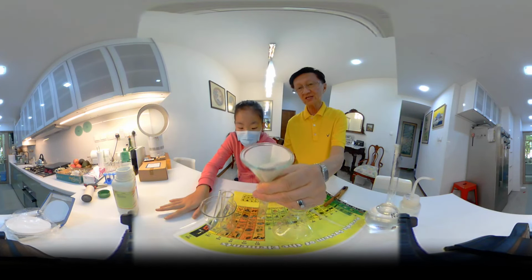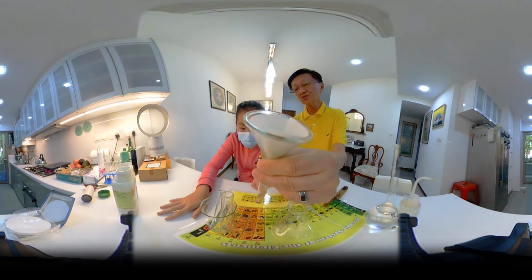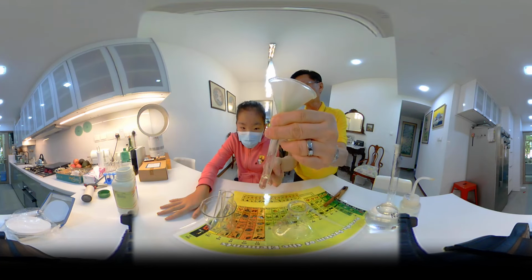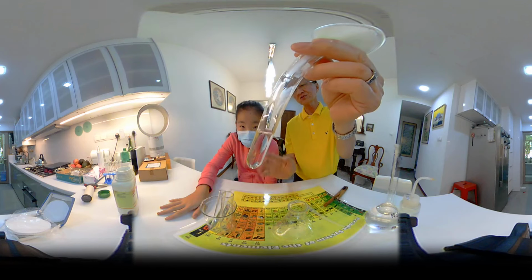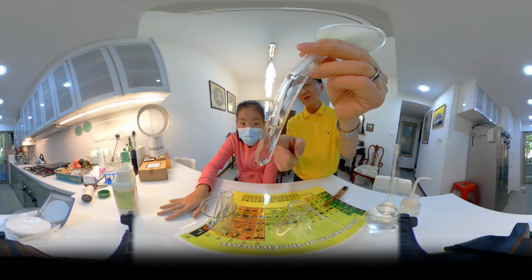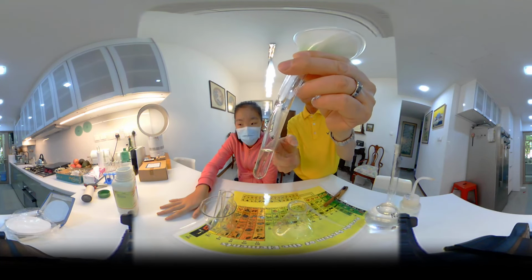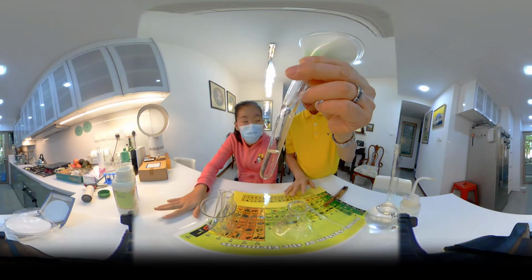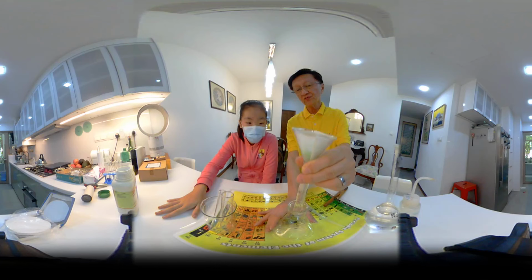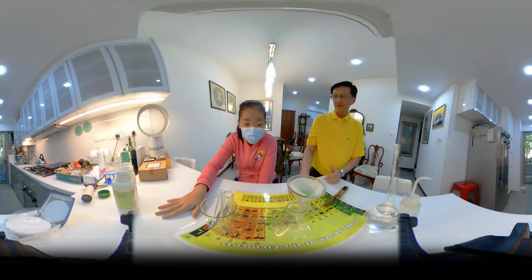And nickel hydroxide is not soluble in water, and therefore what goes through is sodium sulfate solution. And sodium sulfate solution is colorless. We don't say this solution as white. We say it as colorless solution. So this is one way of removing the color of a solution.